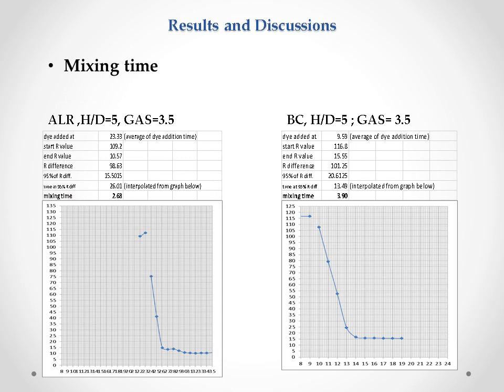The mixing time can be defined as the time needed to obtain a specific degree of homogeneity, and it is correlated with the specific power input and the geometrical parameters of the bioreactor. We used a blue dye to measure the mixing time by recording a video from the adding of the dye until the desired homogeneity. Then we processed the obtained images in the software called ColorMax, which is a color analysis software built by my supervisor. It helped us to collect data and produce the mixing time curves.